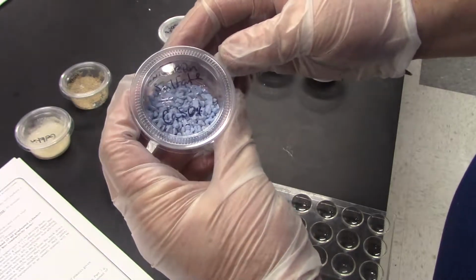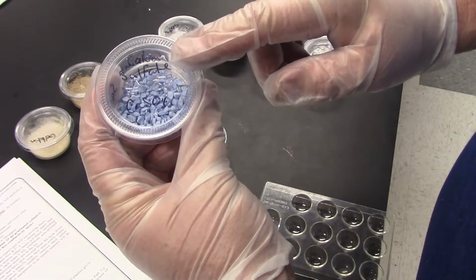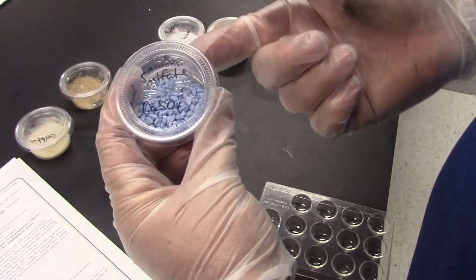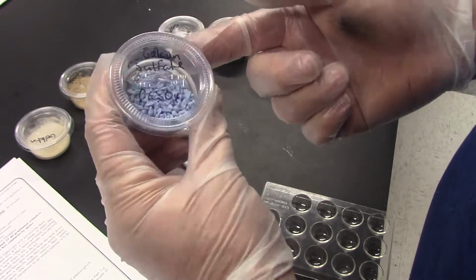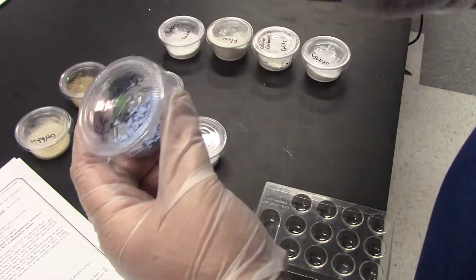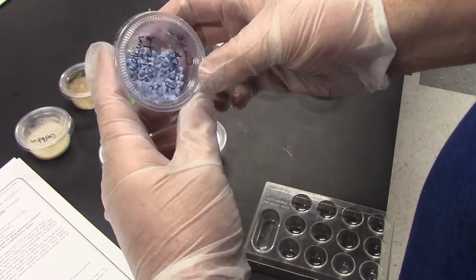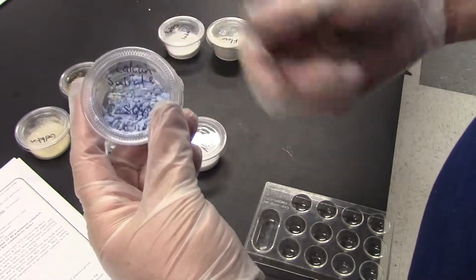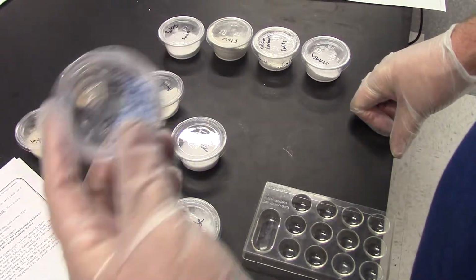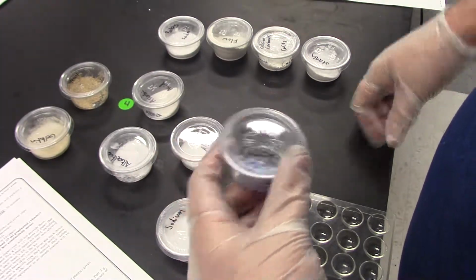This calcium sulfate has a blue color to it, and the reason for that is this particular compound grabs water, and when it grabs water, it's blue. Now, the instructor could mess with you a little bit and make this white. The way they do that is you heat it, you boil off the water, and this will turn a white color. Notice that it sort of looks like aquarium rocks. They might have this crushed up in a powder as well. So you might have to carry out additional tests, but if you see something that looks like this, you're probably good to go with calcium sulfate.